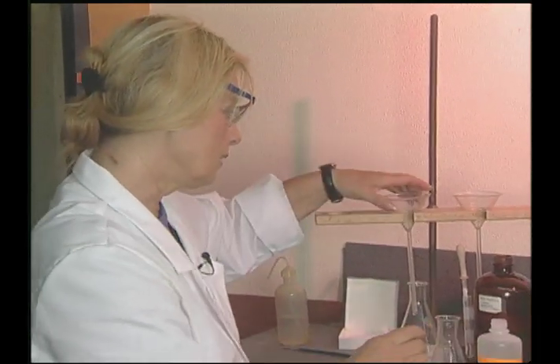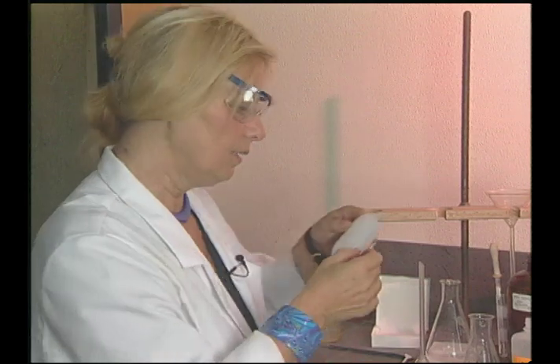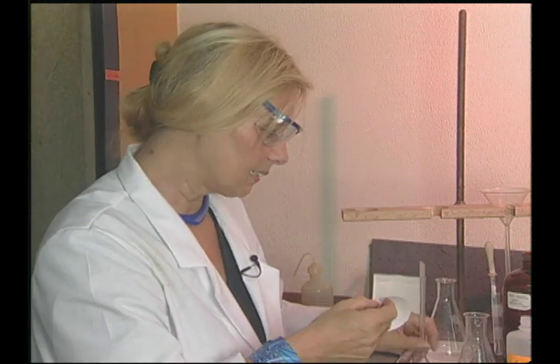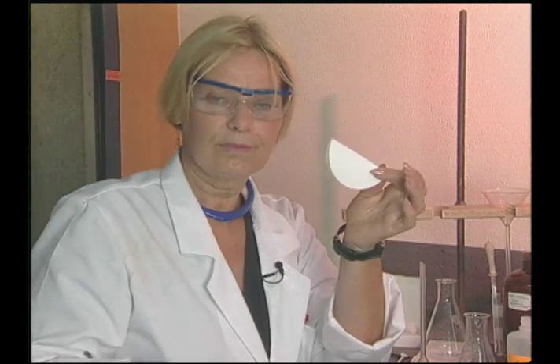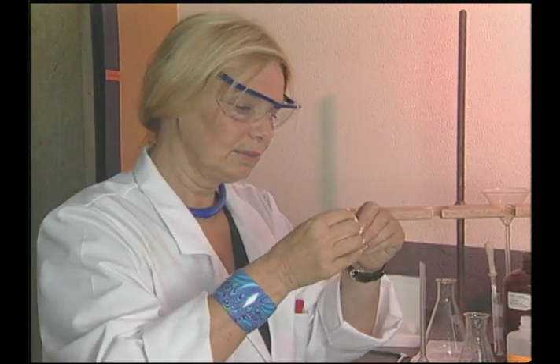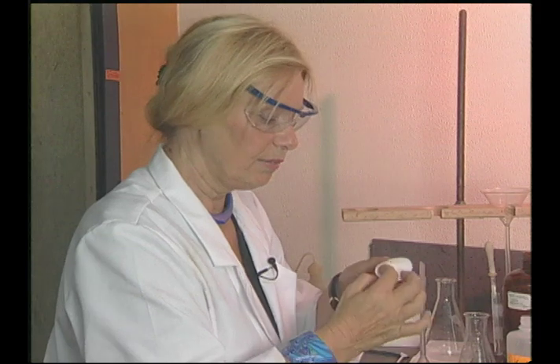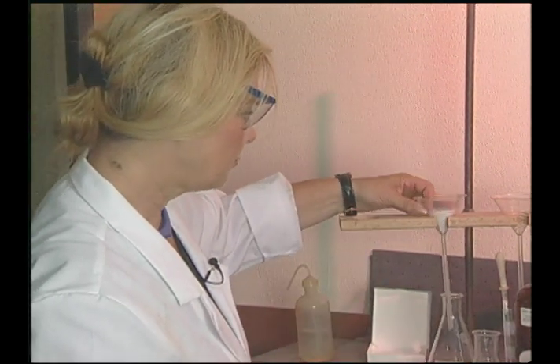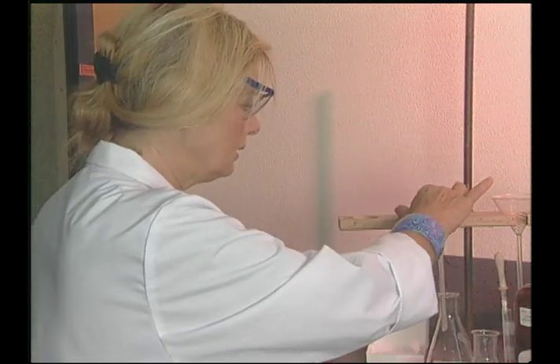So I use my funnel that has to, of course, be equipped with a piece of filter paper, which cannot just be put on top here or stuffed in here like that, like some foolish students might do. We will have to fold it carefully once, and then again. And then we tear off a little corner so that the filter paper will stick to the funnel glass better. In this case, we have a plastic funnel. And then we put it in our funnel rack. We can wet it a little bit with water to make it stick better to the sides.